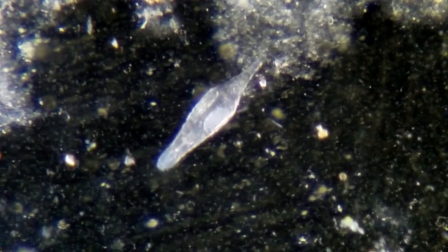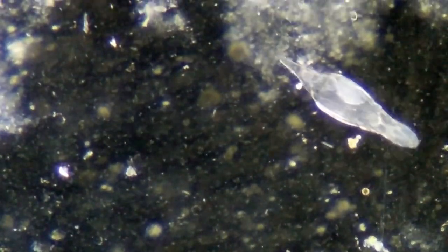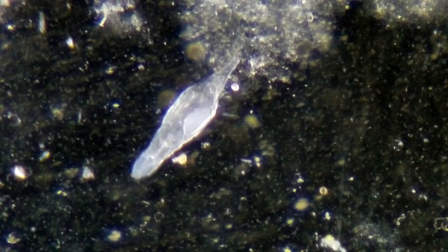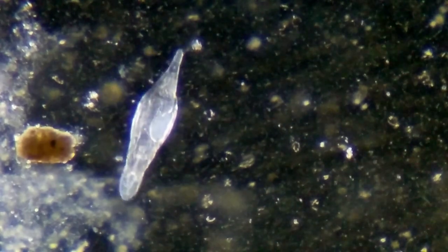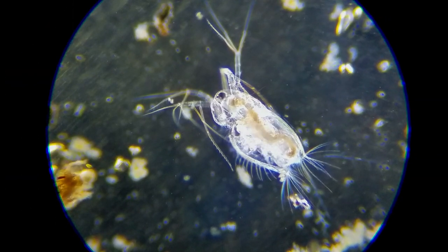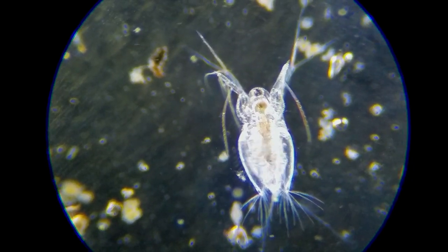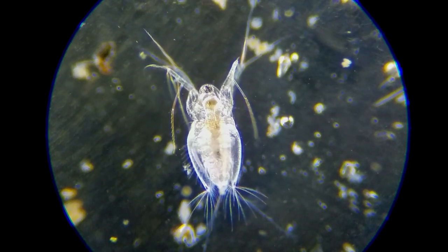Well here's a rotifer, he's just kind of stretching out here, kind of like a clot right here at 11 o'clock. Well he's taking off now. What do you see — a rotifer? What do you see, grasshopper? I think this is a Daphnia here, a water flea. Hands up, you're under arrest Daphnia. These are kind of interesting, very quick in the water too. They can be a pest sometimes.